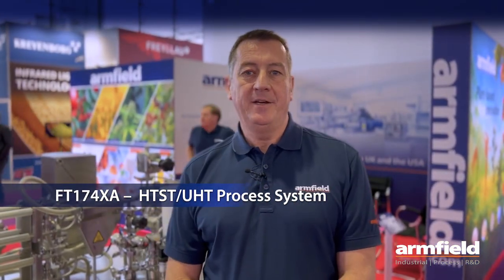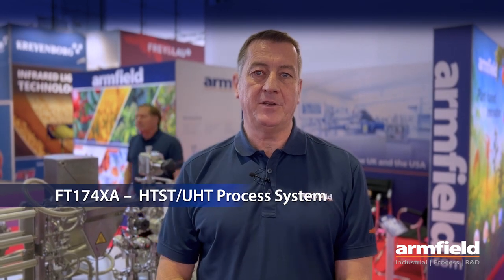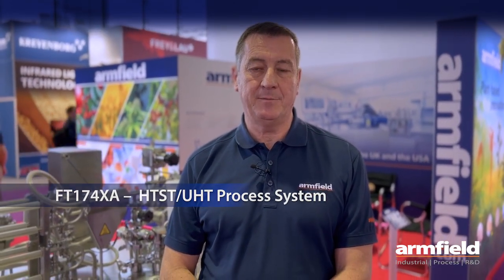At the exhibition this year we are showing our universal and most flexible HTST/UHT system available on the market to date. The system runs products up to temperatures of 150 degrees with varying viscosities, using a variety of heat exchangers.